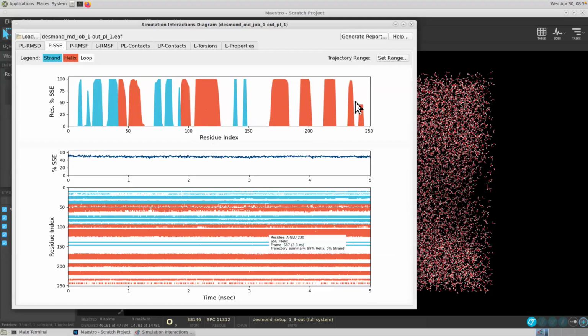If I see the terminal one here, maybe 245 to 248, some 3-4 residues, about 50% is in the helix form, right? And the rest is in the loop form, which means that some secondary structure changes happen, going from loop to helix or helix to loop.